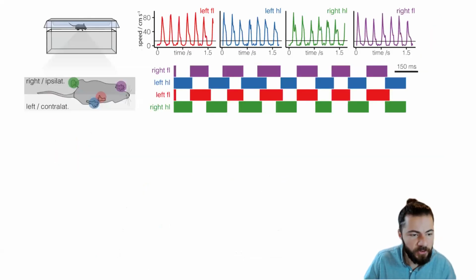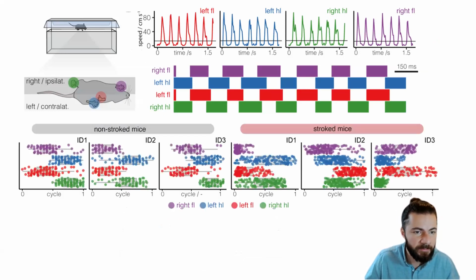We began the motion tracking analysis by assessing the overall gait from the bottom perspective at baseline and after injury. Individual steps were identified by the movement speed of each limb between the frames, and the footfall pattern, for example, showed a typical gait synchronization of opposing front and back paws in uninjured animals. Now, if we look at the step cycle in injured animals, we see that the pattern was severely altered.